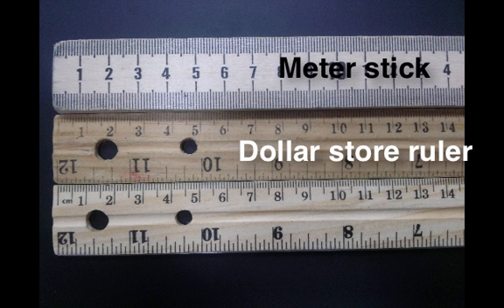Now I've tried to take those three different measuring tools and line them up at their leftmost edge so that they were all measuring 0 at the same time point. You can see that marked with the red line.